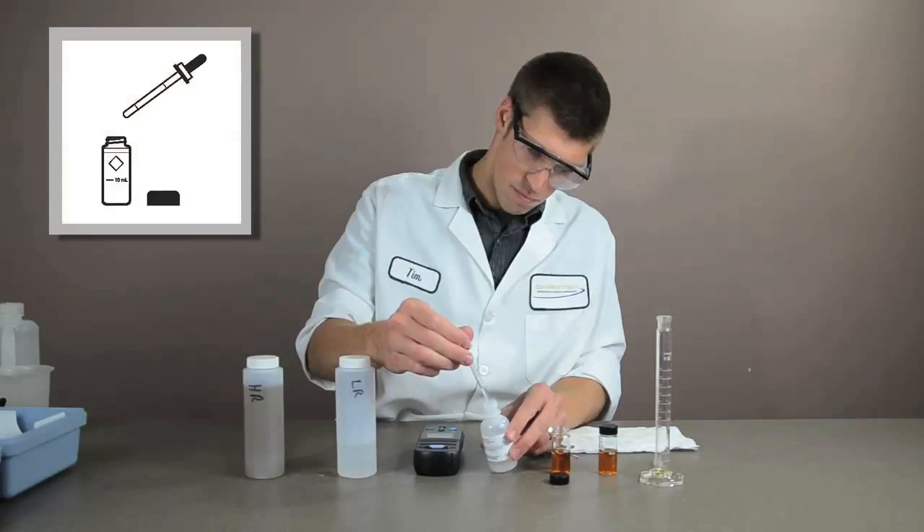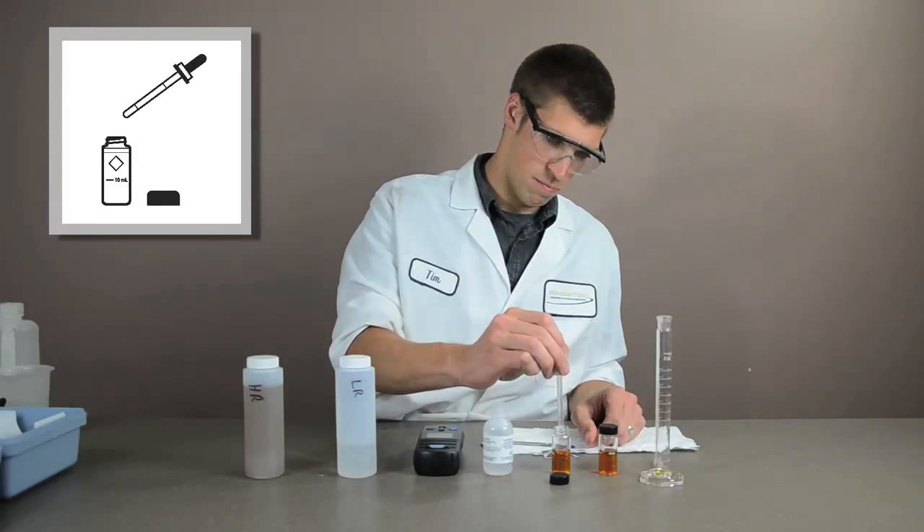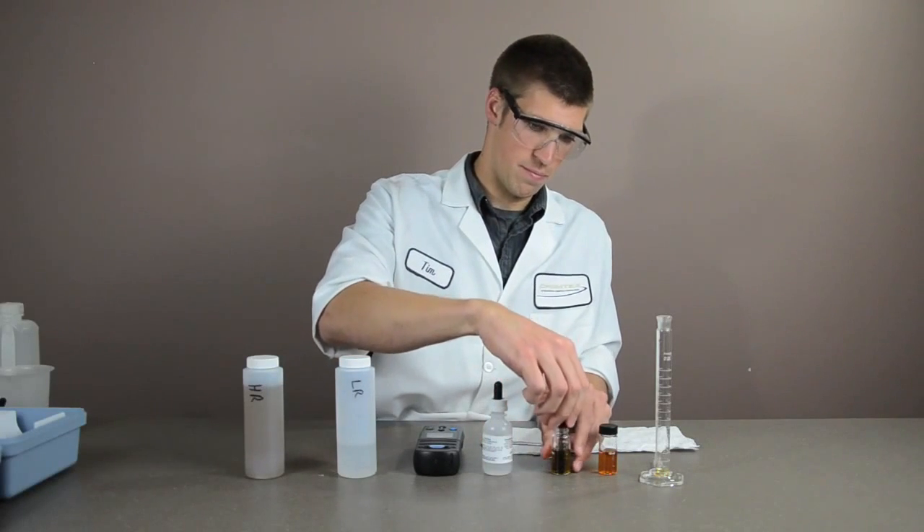Using the calibrated dropper, add 0.5 milliliters of molybdenum 2 to the sample. Cap the cell and swirl to mix.